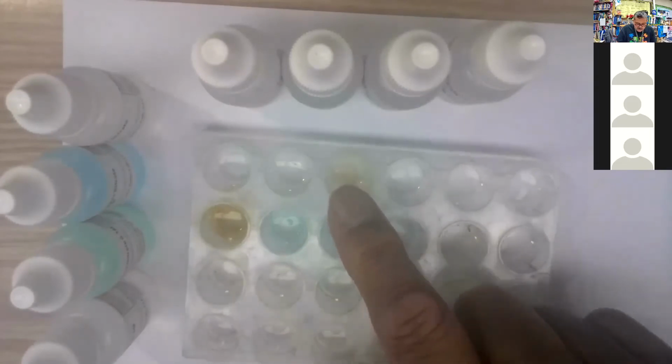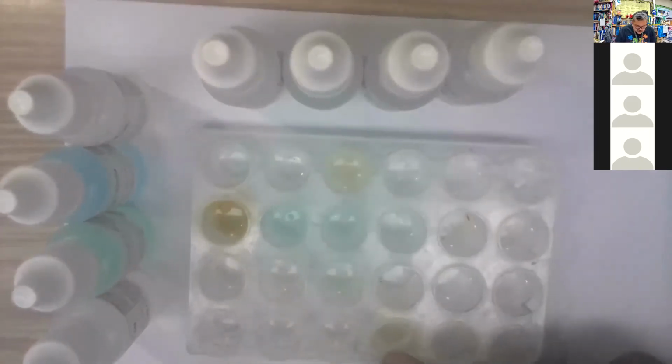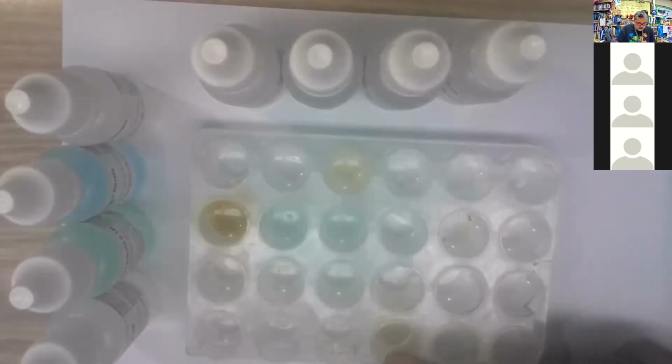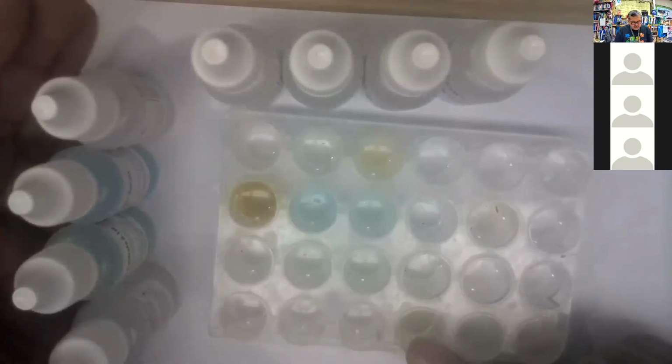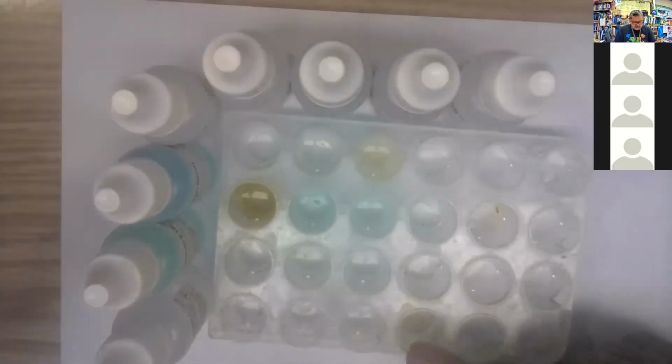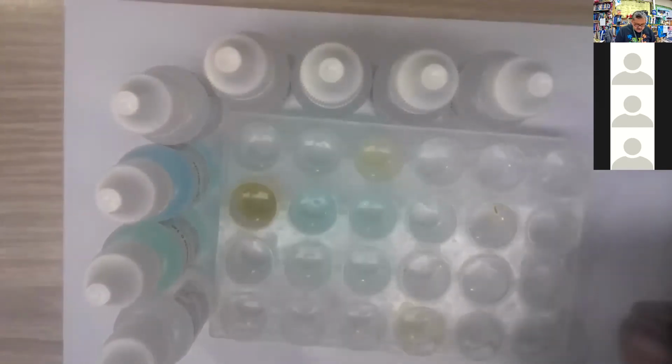The calcium nitrate reacted with the sodium oxalate over here. And then the other one that we saw was in the bottom right corner, sodium sulfate and zinc nitrate seem to have some kind of reaction. Okay, so they were all color reactions, no strong precipitates that we were able to see.